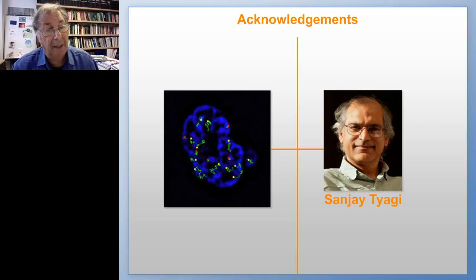But I think here is the main thing. No matter what the identity of the mutation, a super selective primer can be designed to selectively amplify just that mutation, even if the only difference between the wild type and the mutant is a single nucleotide polymorphism. Not only can it be identified in a liquid biopsy sample, hopefully, but it can be quantitated, and the relative abundance of the different mutations should provide meaningful clinical information for modifying therapy personalized for each patient. And that could make a big change in cancer and how we treat it. That's my answer.